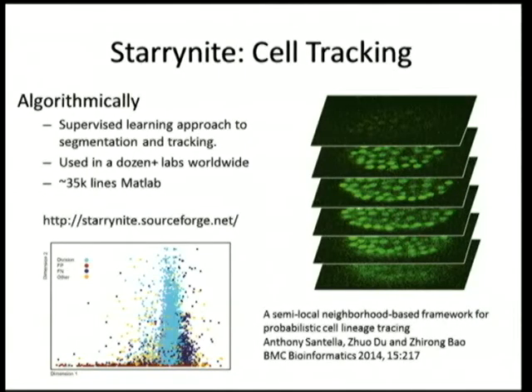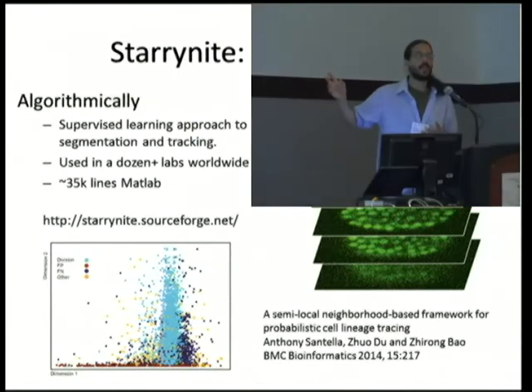Without going into details about algorithm and the like, it's a piece of software that's really optimized for doing robust cell tracking in images that are crowded and undersampled axially, where you don't have as many slices as you'd like, which is really critical for doing this kind of analysis where you want to track in a reasonable amount of time with perfect accuracy hundreds of embryos over hundreds of time frames, hundreds of cells.